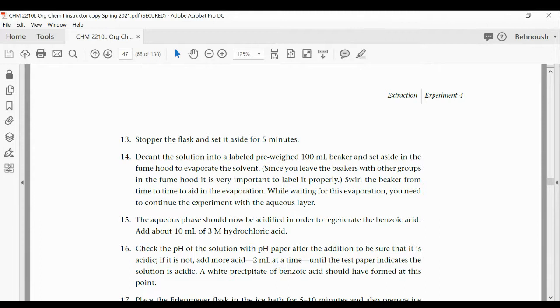To dry the solvent, to dry the ether layer. Drying meaning removing traces of water, or drying out any water that is left in the organic layer. What happens if you have water in there? The boiling point. In the next step, you need to evaporate the ether to end up with the neutral compound only. Ether evaporates at 36 degrees Celsius, or in the fume hood it would evaporate on its own without even boiling. But water boils at 100 degrees Celsius.